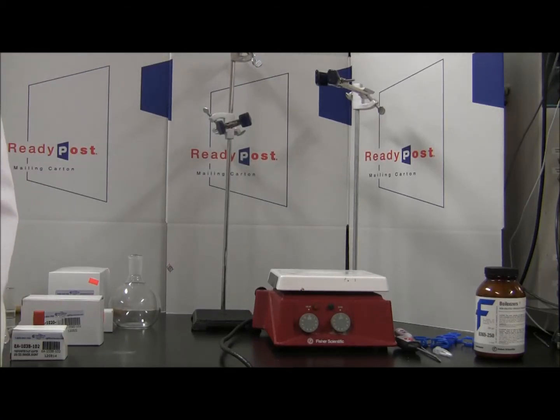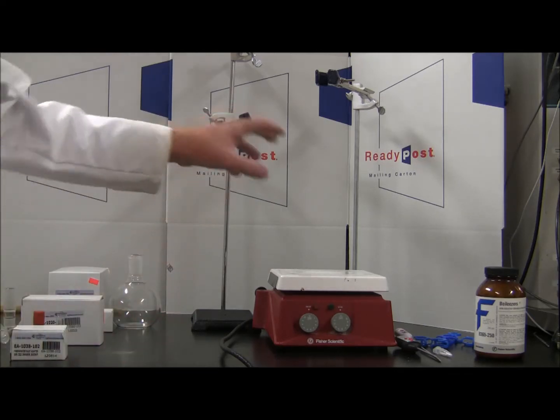This video is on the setup of the distillation apparatus as part of the Woods to Wheels biomass to ethanol program. There's a kit available for this. You may have received that. As part of this video, we'll look at what's in the kit and what you need to supply to do the project. First off, we're going to start out with a hot plate.